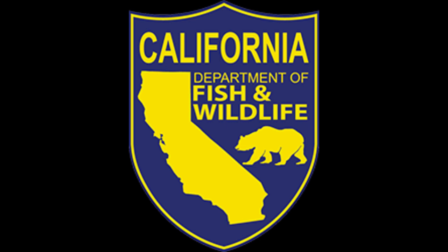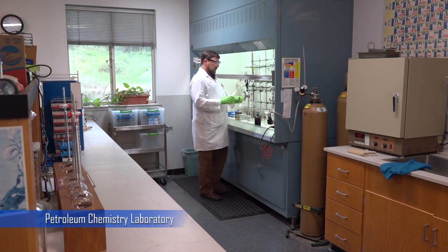Getting some into a vial and diluting it, dissolving it with dichloromethane.